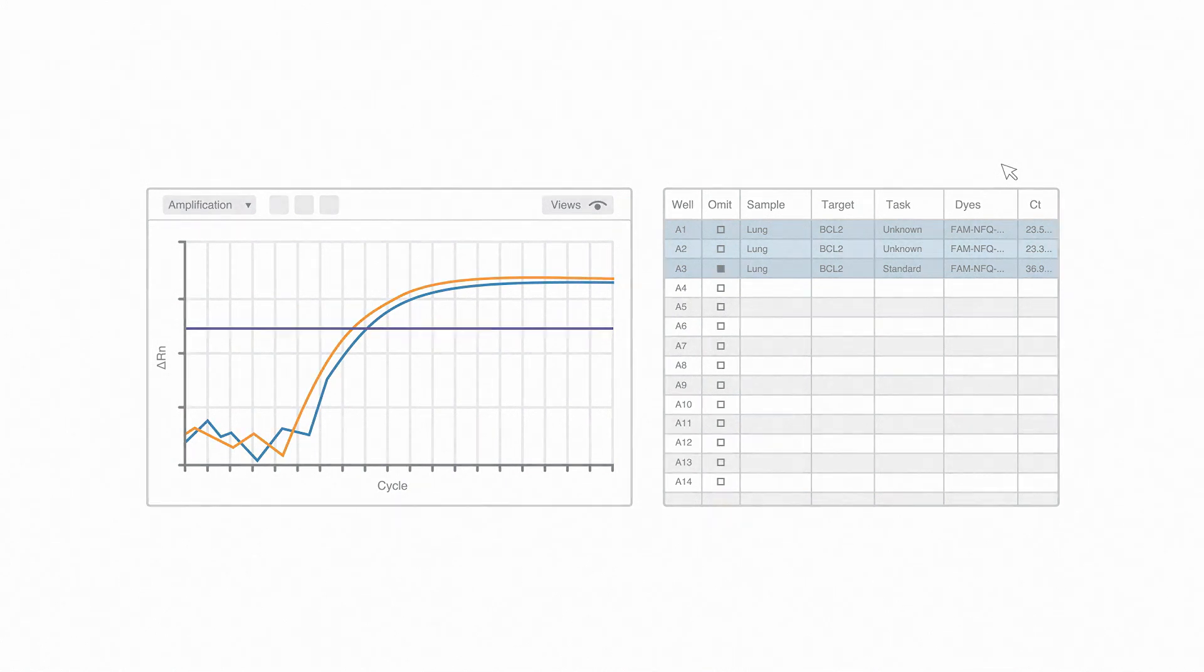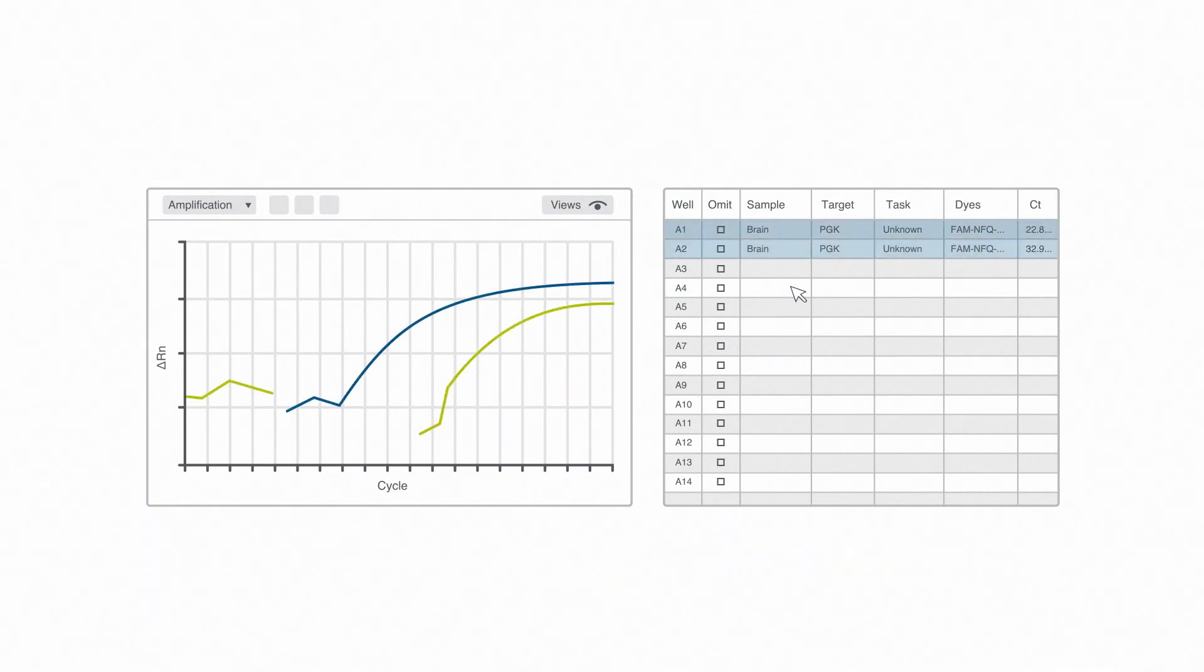But let's look at another example. What if I only ran duplicates? Now I have two samples with CTs of 22 and 31. That's a lot of variation in a replicate. I don't really want to average them, but I don't have any justification for using one over the other. Now I'm forced to omit the entire sample from my data.